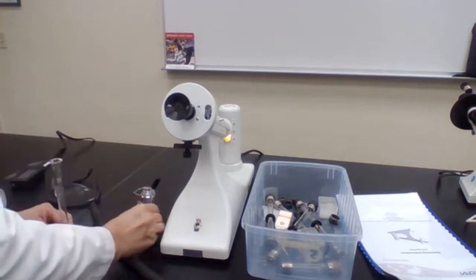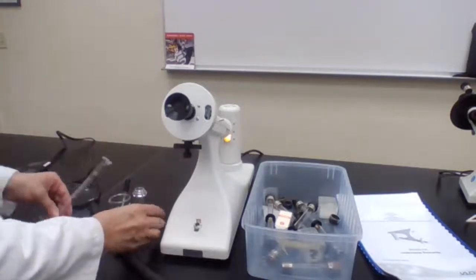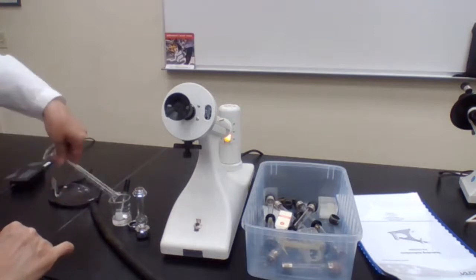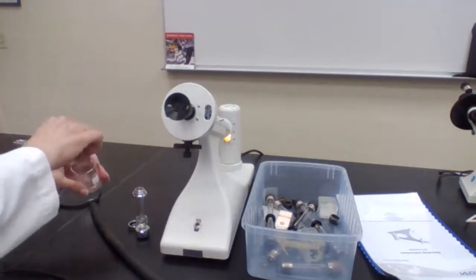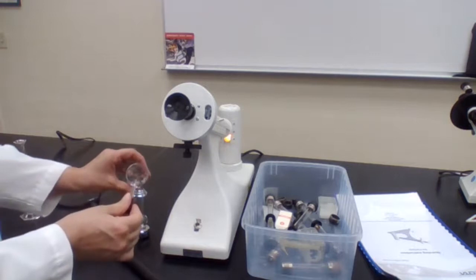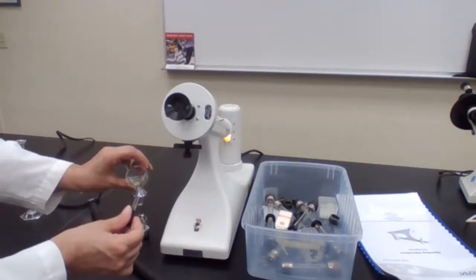Okay, going to put it back because I want to make sure the solution is mixed well. I'm adding just 2.6 more milliliters because I had 7.4. Now it is 10 milliliters. So the volume of the solvent is 10 milliliters instead of 7.4, so our calculation is going to slightly change.